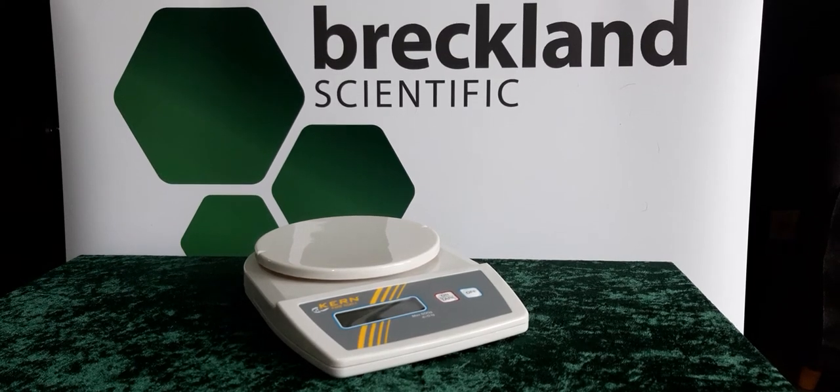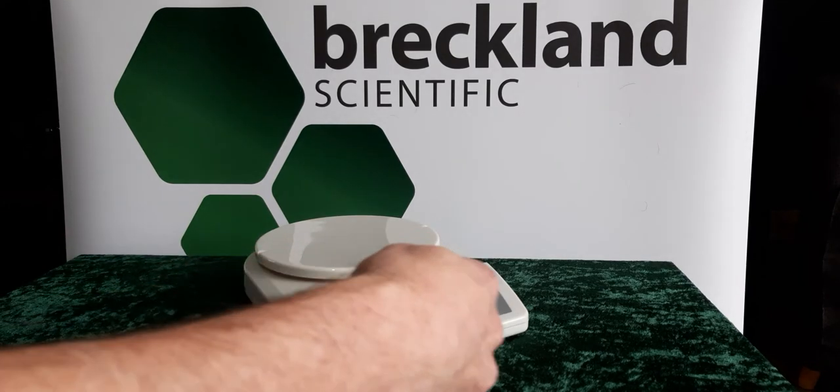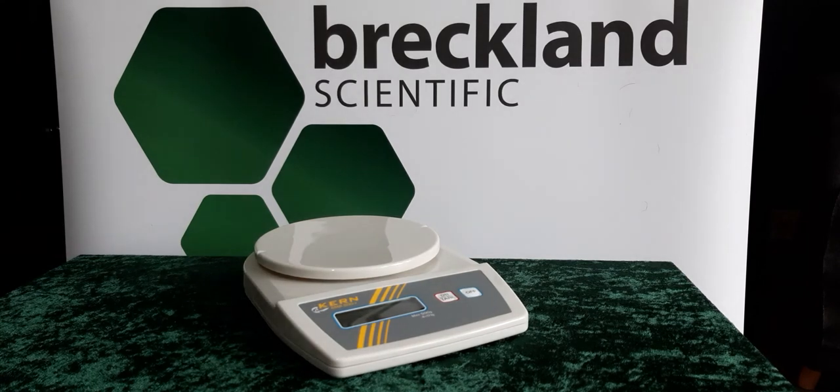Here we have the Kern EMB500 digital balance. A capacity of 500 grams and a readability to one decimal place. The simple two key operation makes it ideal for use in schools and universities.